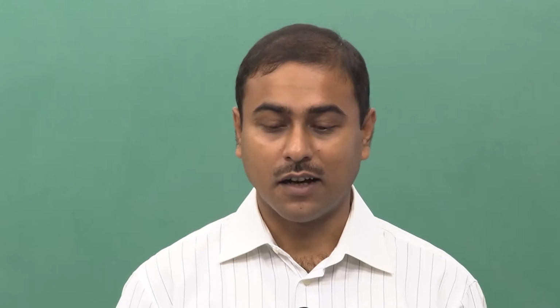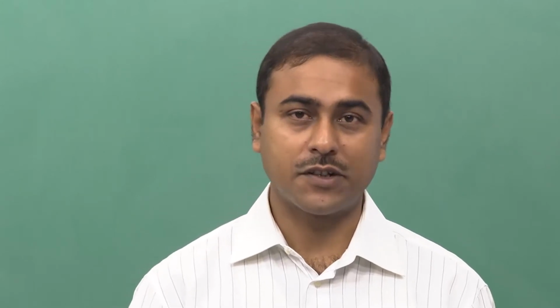So, welcome back. In this lecture I am going to discuss the basic instrumentation of the fluorimeter. The fluorimeter is the instrument where we measure the emission spectra, the fluorescence spectra of your sample. Till the last lecture we discussed the different properties and parameters of fluorescence, and out of these, the first is the intensity. That should be measurable in the fluorimeter.